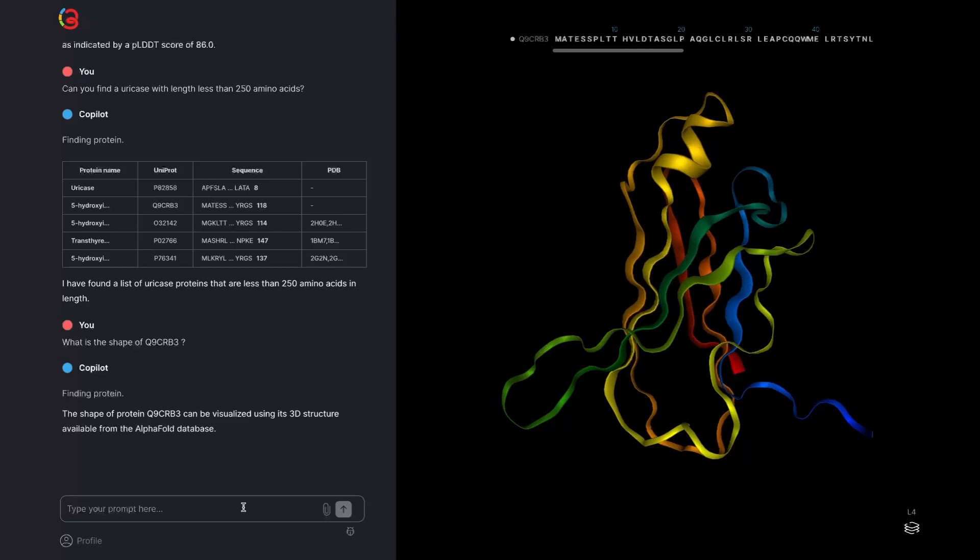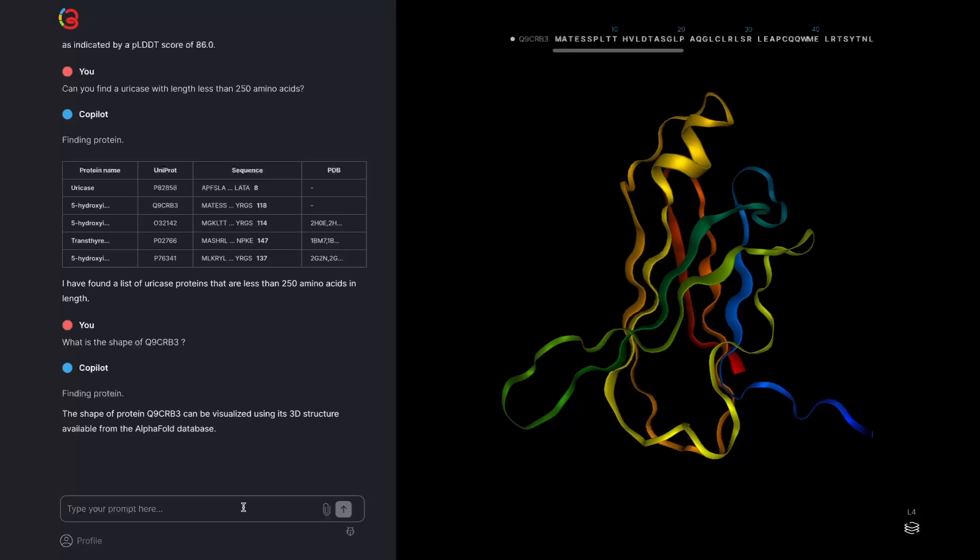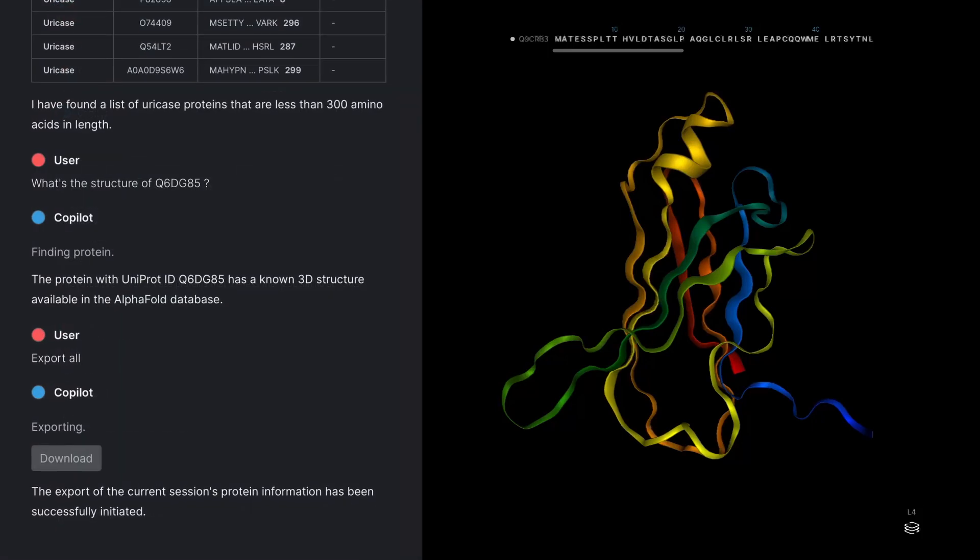Finally, you can download all the PDB files generated in this Copilot session by asking it to export all. Clicking on the generated button will download the zip file with all of the files you need.